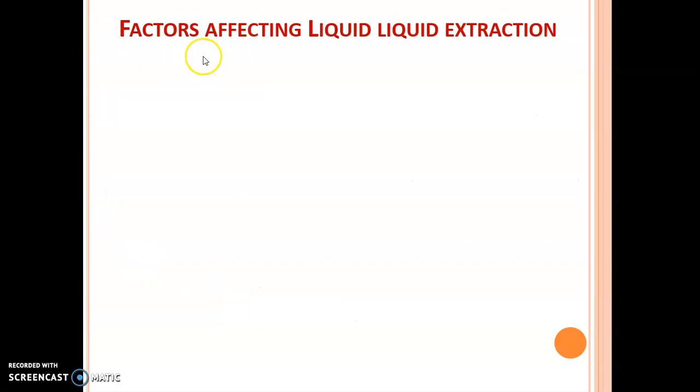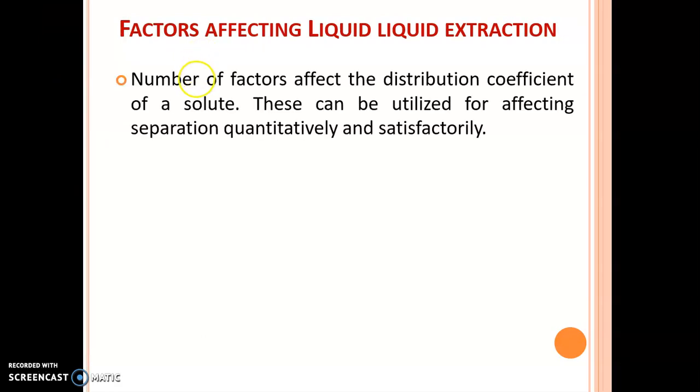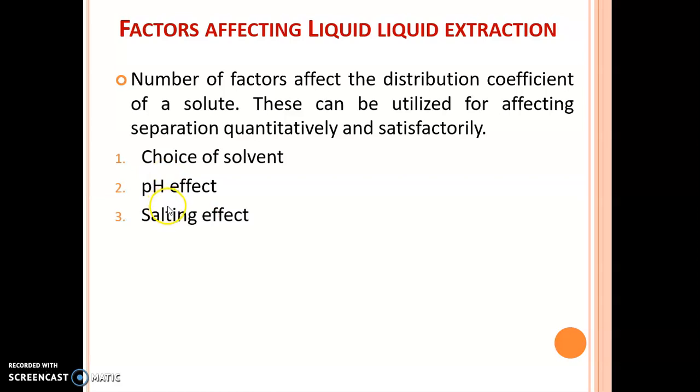Now let us see some factors which affect this technique, that is, the liquid-liquid extraction method. A number of factors affect the distribution coefficient of a solute. This can be utilized for effecting separation quantitatively and satisfactorily. Such factors are: first, choice of solvent; second, pH effect; third, salting effect; fourth, control of hydrophobicity. Now let us start with them one by one.